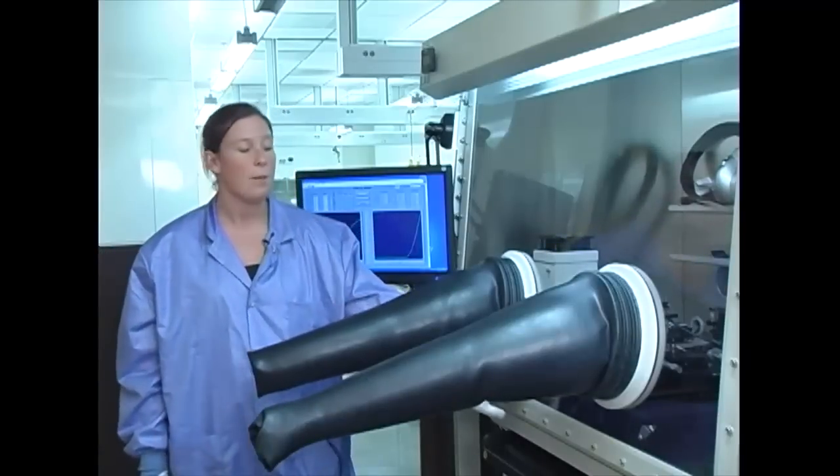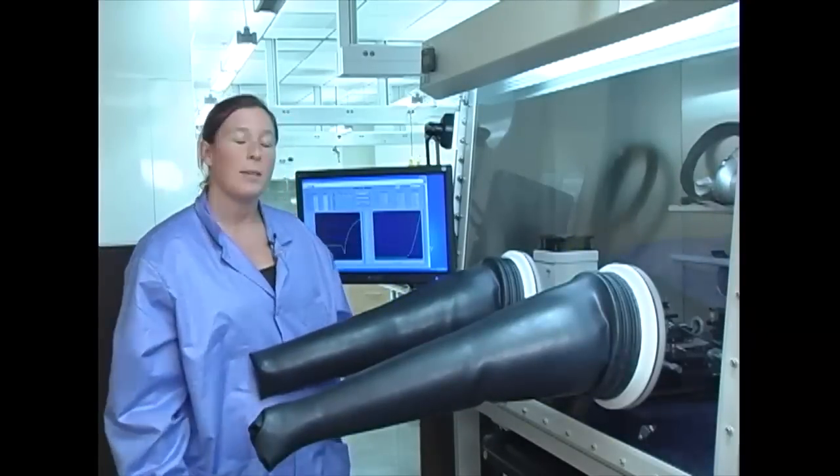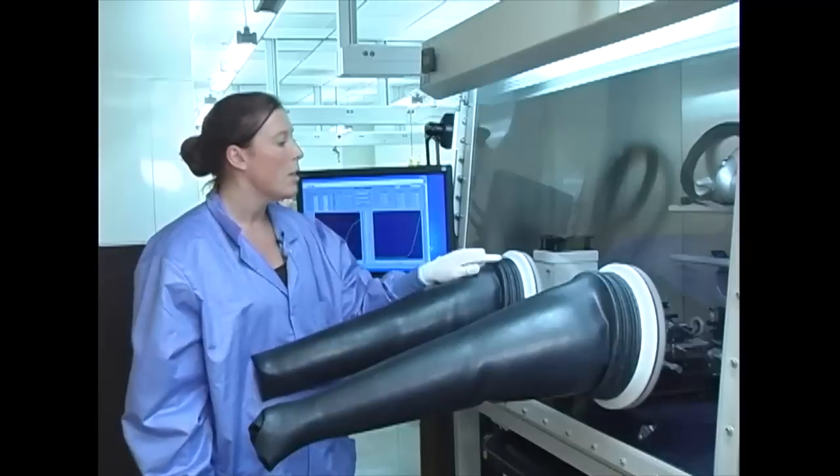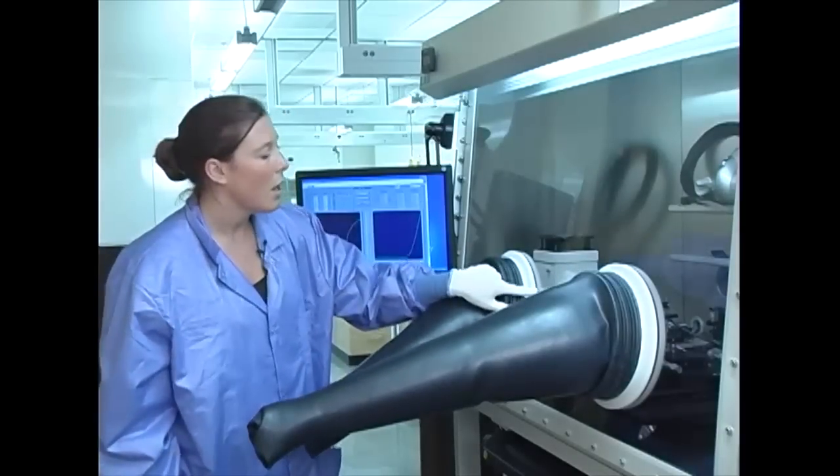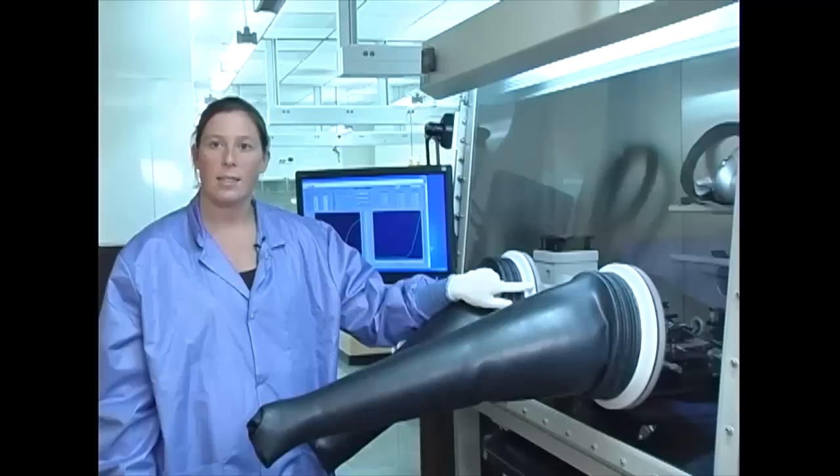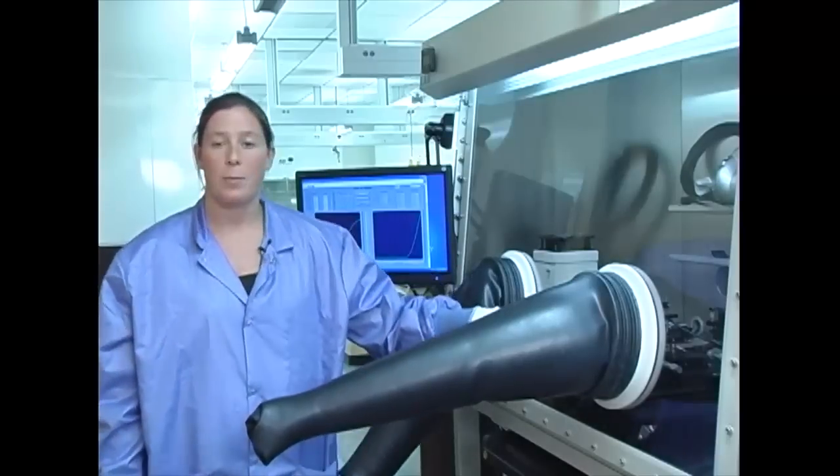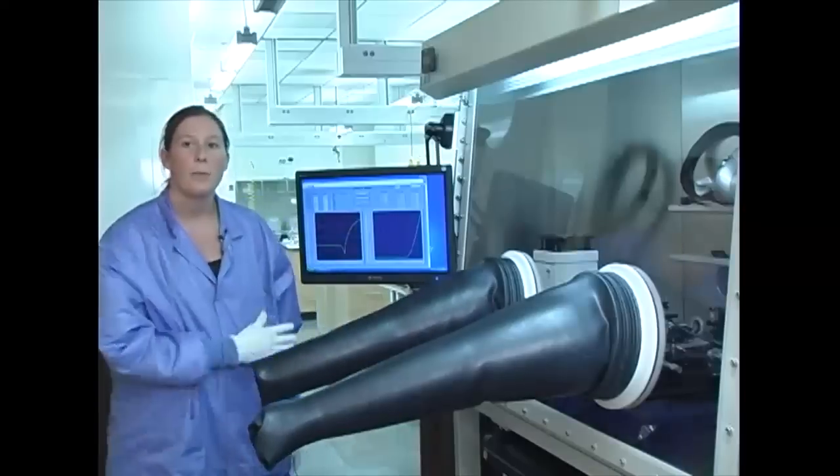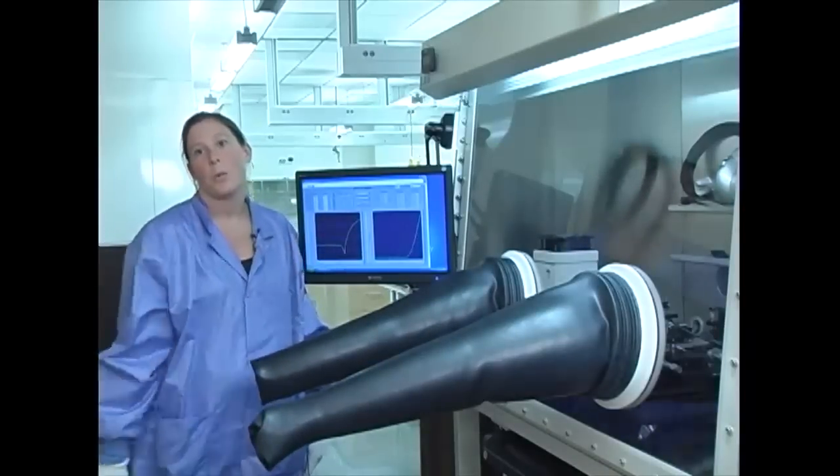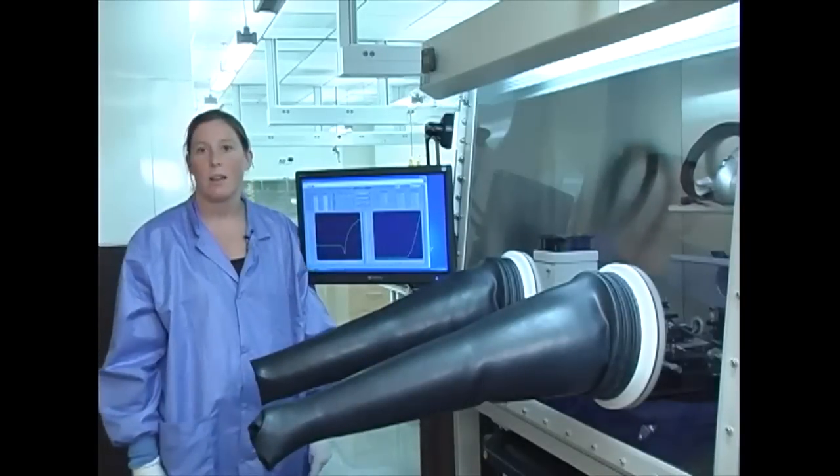Inside our glove box, we have our setup system, which involves a simulated sunlight source, some optics to focus the light, a filter wheel that controls different intensities of the light, and then a sample holder and testing system. This is all run by a computer that will let you visualize your data in real time.